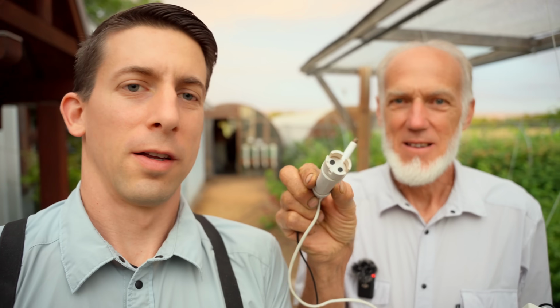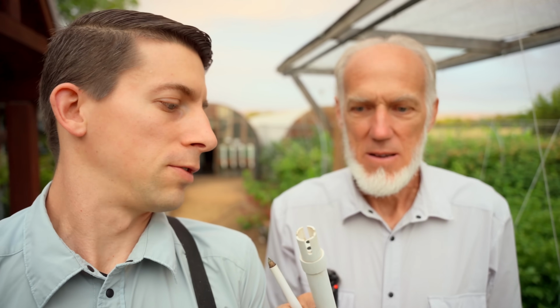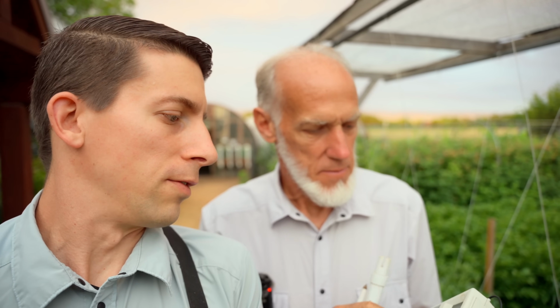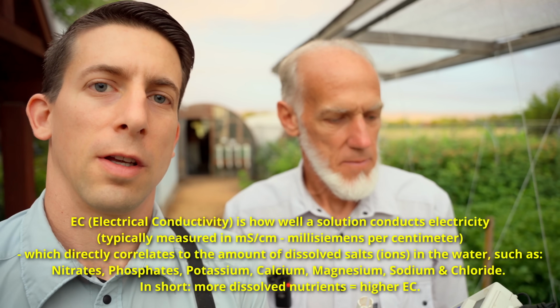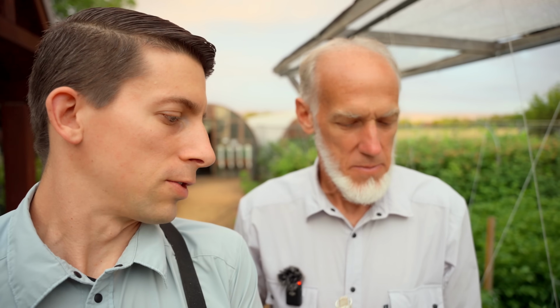This probe right here is what they call the EC probe, or temperature probe. So it does two things. It measures the EC, electrical conductivity, of your solution. You use that when you're doing hydroponics and liquid fertilizers. It tells you how potent your nutrients are in your solution, and it also tests the temperature of your solution.